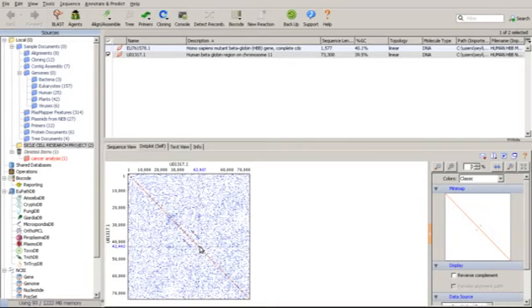This dot here makes us understand that there is a particular nucleotide sequence, or nucleotide bases, that exist in this area that is being compared between the two strands. So this is telling you that there is a nucleotide sequence here that has a similar resemblance, so they are similar in the relationship between the two sequences.